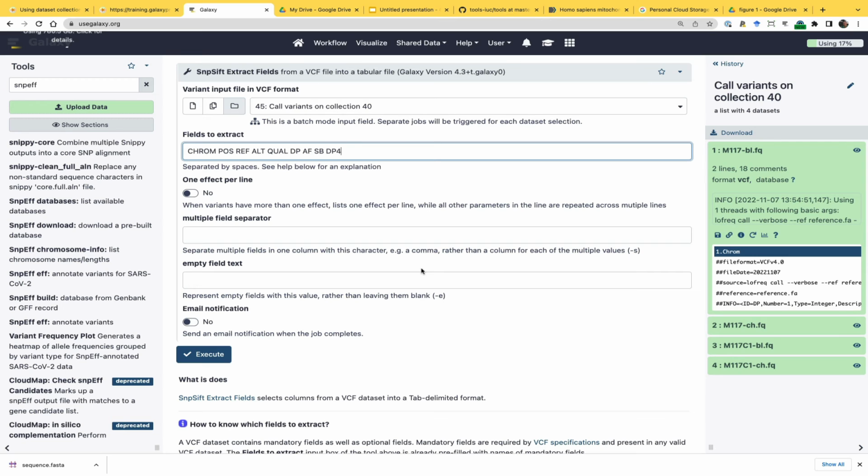You have to be careful, because sometimes you do variant calling from RNA-seq data, and RNA-seq data can be stranded. You have stranded RNA-seq protocols. So in this case, you're going to have calls that will be biased. But they're not biased because they're bad. They're biased because of your protocols. You need to know what your protocol is.